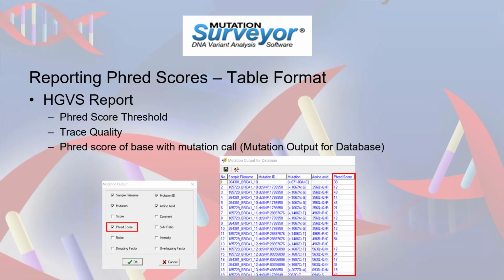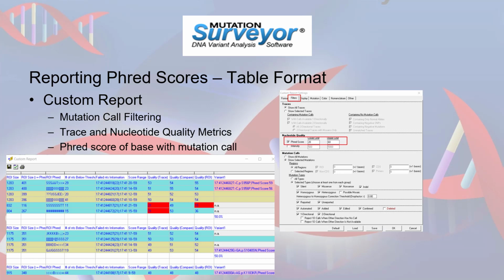The HGVS subreport mutation output for database includes a setting to display the Phred score of the base call at the position of the mutation call. The custom report is another report option that includes several options for utilizing Phred score to report both nucleotide quality information and overall trace quality.